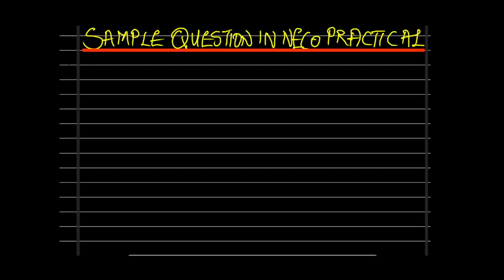Before we do that, let's quickly take some basic information. We could be asked at any time to calculate the molar mass of the substances that we have. Our sample A, which is the acid, we have it to be H2SO4.